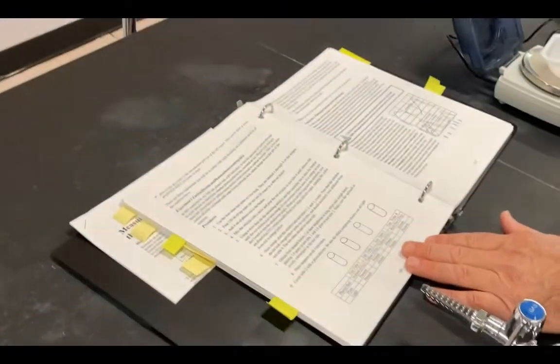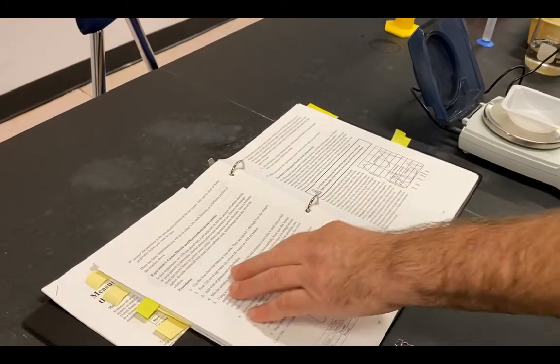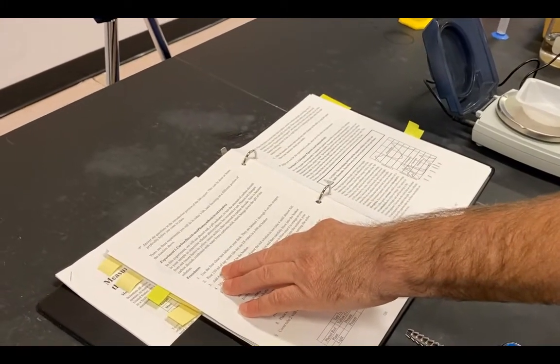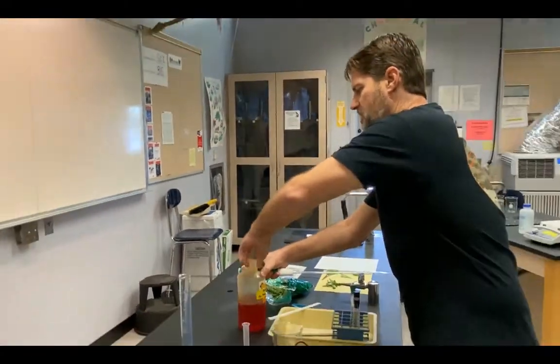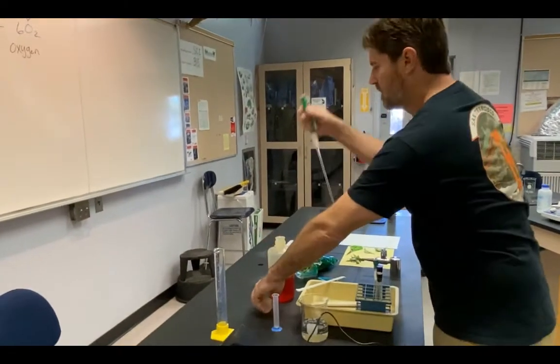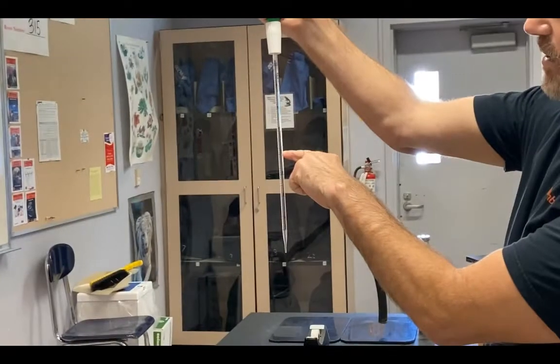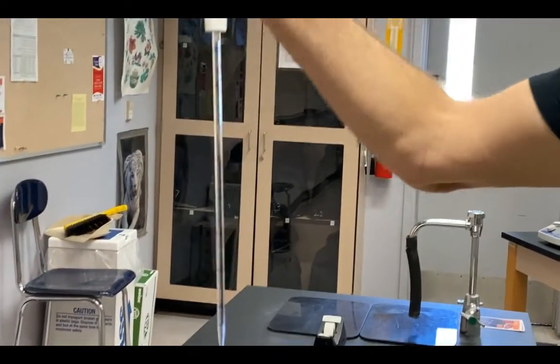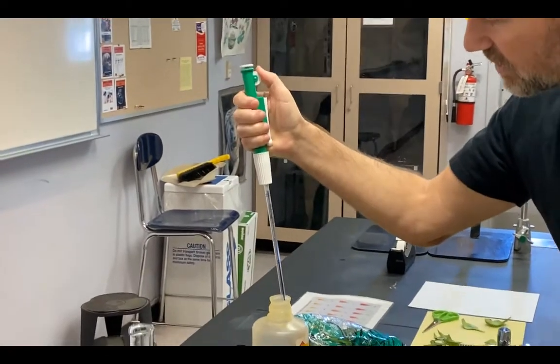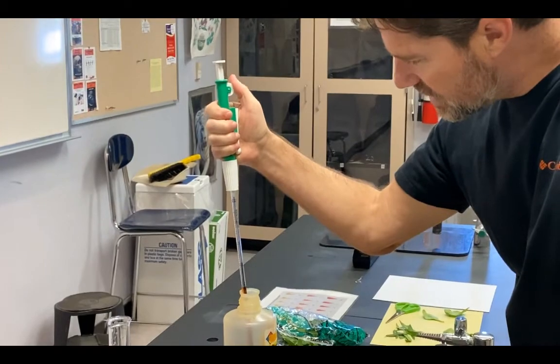Right now I'm on pages 126 and 127 for this particular experiment. I do have my 130 milliliters of tap water. I need 4 milliliters of phenol red, and I can extract that using this pipetter here. In order to do this, I need to go up to the 1 mark right here. You can see that I have a 0 up here, and if I fill up to the 1 on this 5 milliliter pipette, I will have 4 milliliters of solution in there.